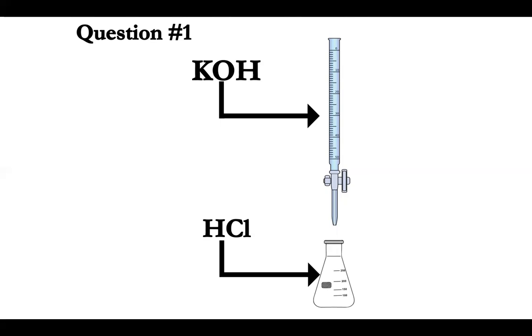Yeah, we're going to know the concentration definitively of KOH. We do not know the concentration of HCl. We do know the volume though because we're the ones who filled this Erlenmeyer flask up to 20 milliliters. So we know the volume of our hydrochloric acid, but we just don't know how strong it is. And obviously we don't want to exactly put it on our skin to find out because it could be a really high molarity.